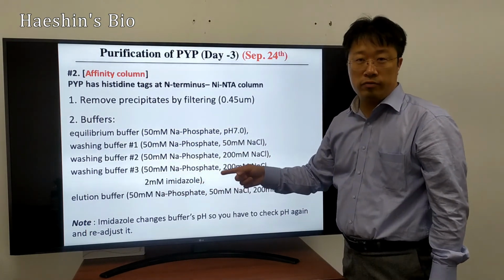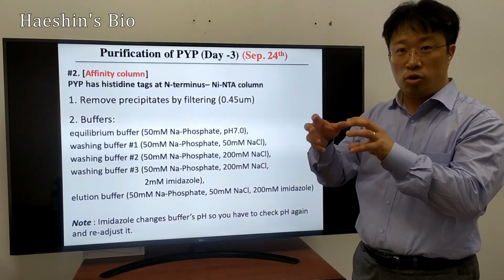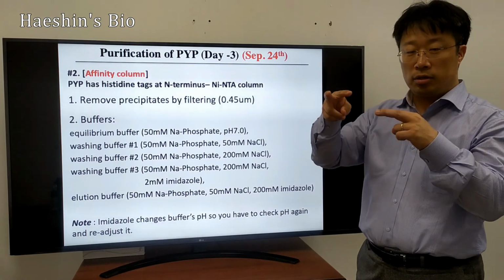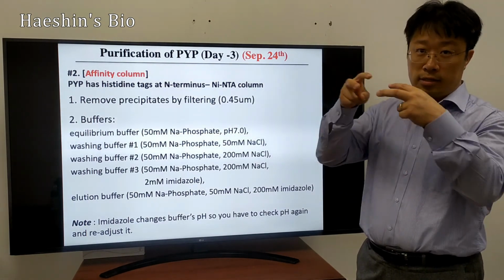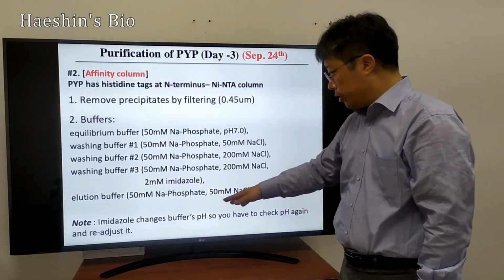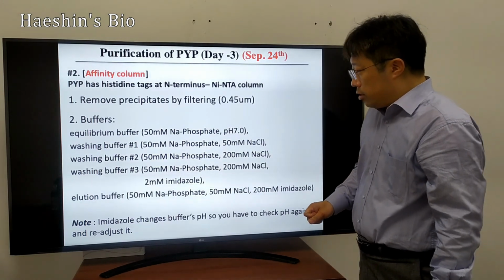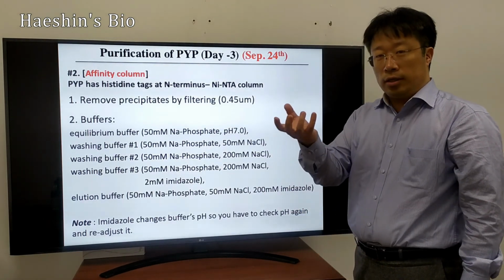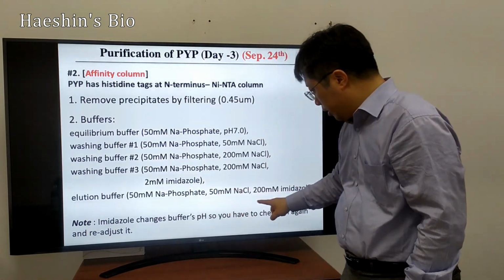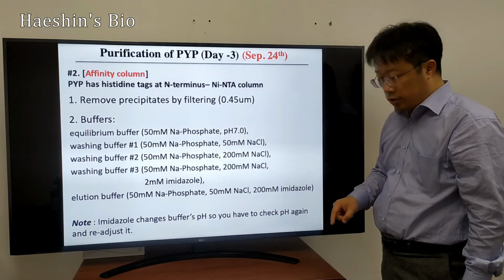Remember that in the previous class, we have a histidine tag, and how we elute it: lowering pH, or adding the imidazole. Imidazole is a side chain of the histidine that is replacing the histidine tag binding. So basically you add a lot of histidine side chain amino acid there. So actually you elute it from this column that is tightly bound by the affinity column. Then you add this higher concentration of imidazole solutions.